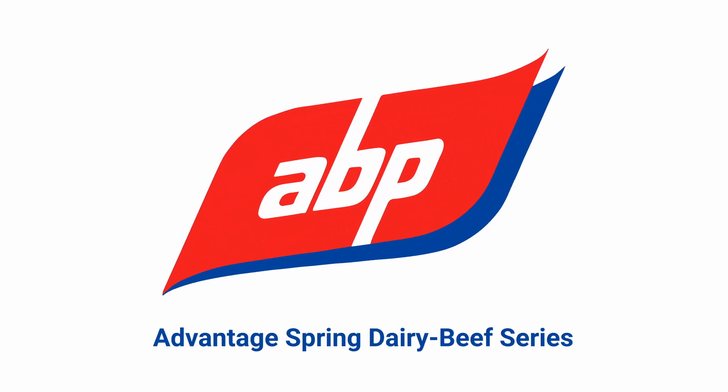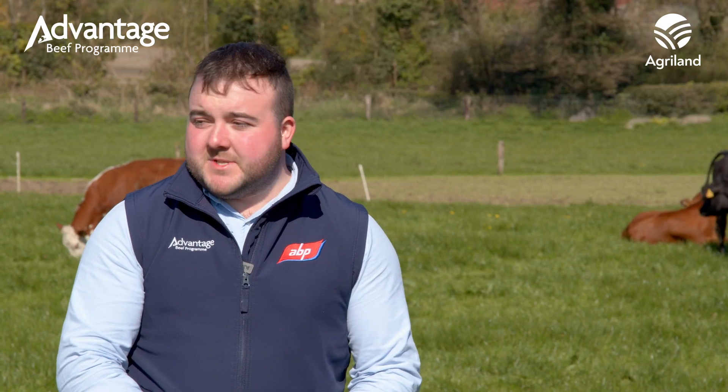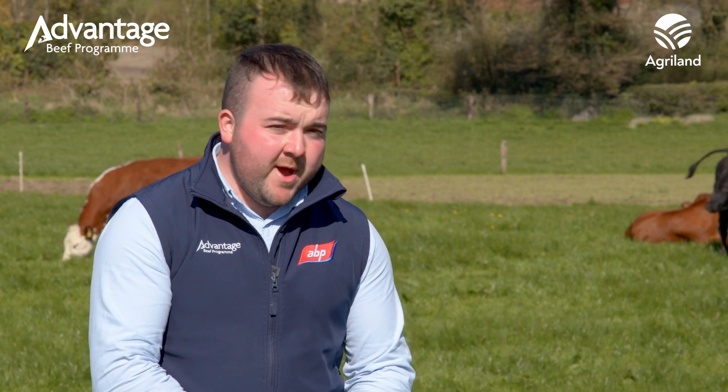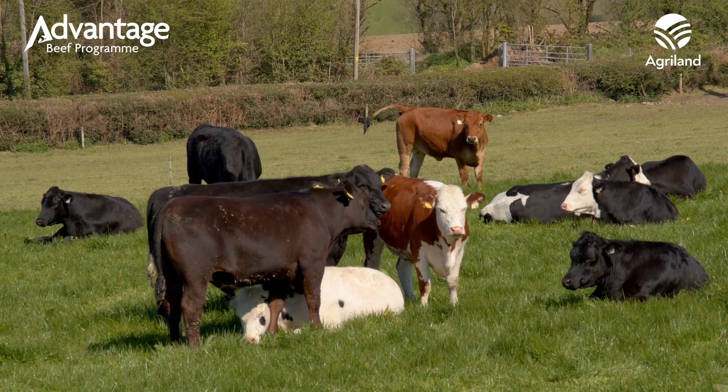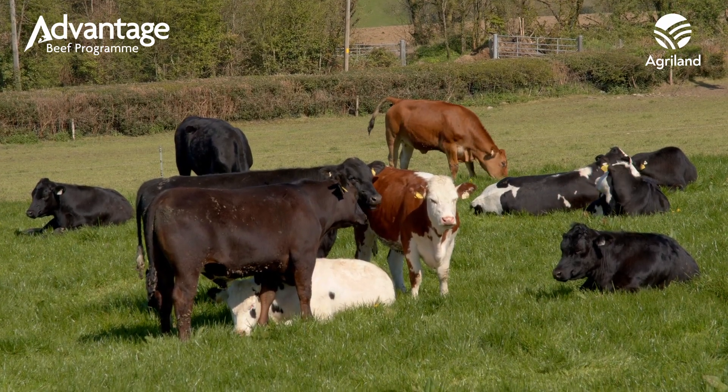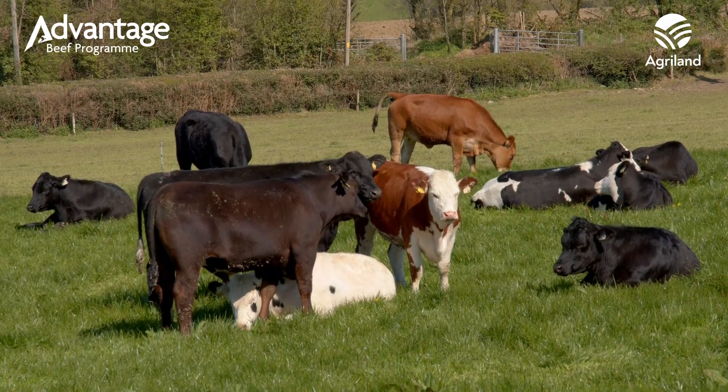We're here in the field of cattle today to talk about dung sampling. Dung sampling is a great tool to identify a worm burden within your herd, as well as checking how well your wormer has been working. With legislation tightening up, it's very important that we are targeting the exact strain of worms in our animals by using a shorter spectrum dose.